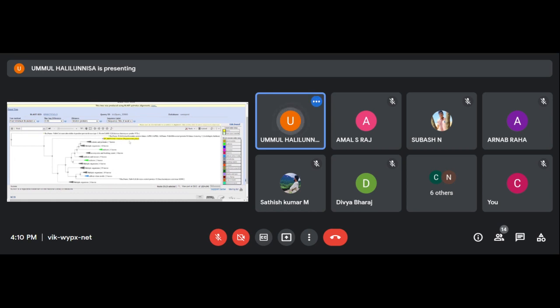If you see here, our Trypanosoma grayi is in this region, which is closely related to this region, showing homologous sequences. And this is how this graph has been generated. The farthest one is the first one, calcium calmodulin dependent protein kinase type 1, short CAMK from Saccharomyces. This is the farthest thing that we have found from this kinase from Trypanosoma grayi. This one is the farthest one, and these are the nearest ones.